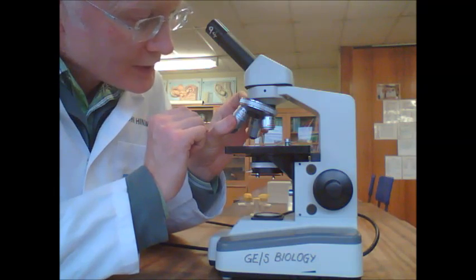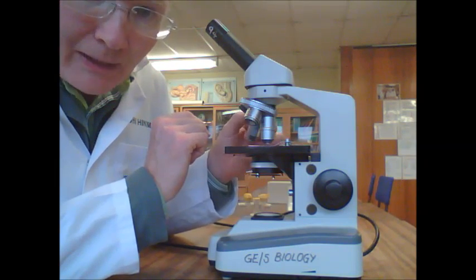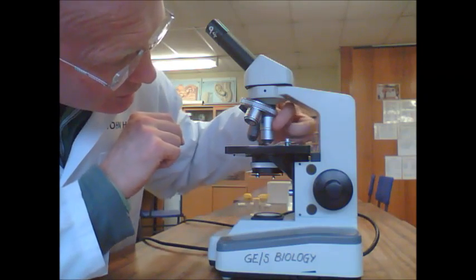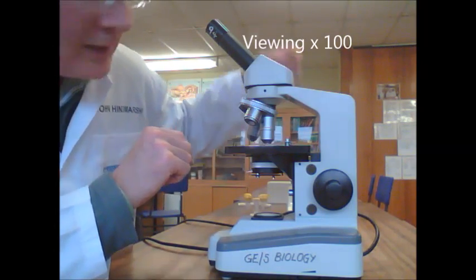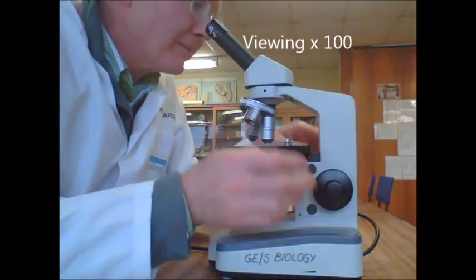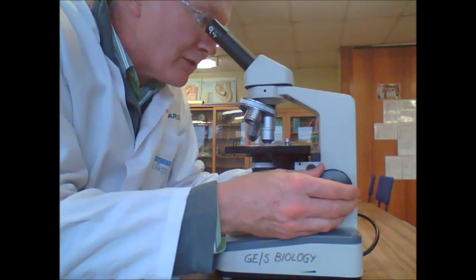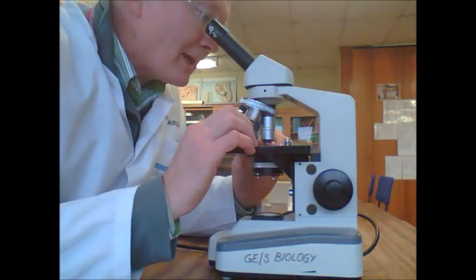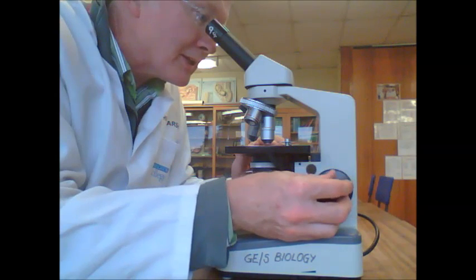Once it's centralised, you can then look more closely on medium power. This one has a yellow band on it and says 10 on it, so this is 10 times 10 — that's 100 times magnification. You can just re-focus slightly on that one, and you may need to re-centralise the thing you're looking at.